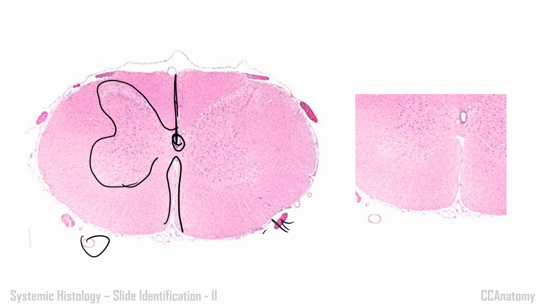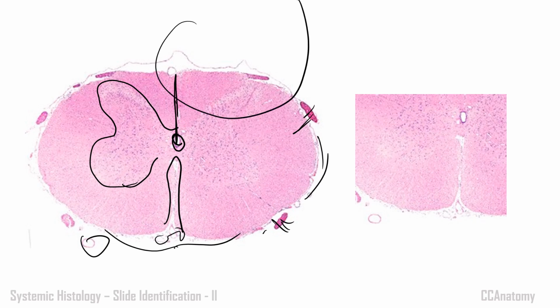Okay, these are the nerve roots which are coming out. Posterior spinal arteries are there. And the coverings you can also see. Here the anterior spinal, the covering also you can see. Why I'm saying all these points, because when it is focused under the microscope, you can hardly see only one small part of it, as shown in this image.